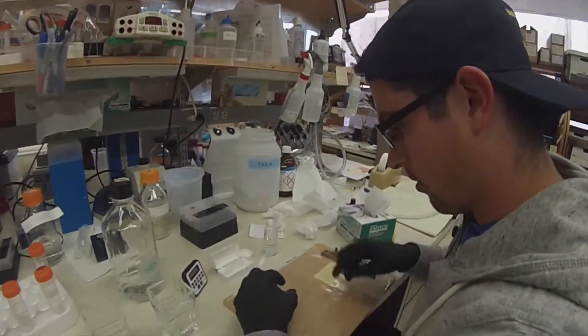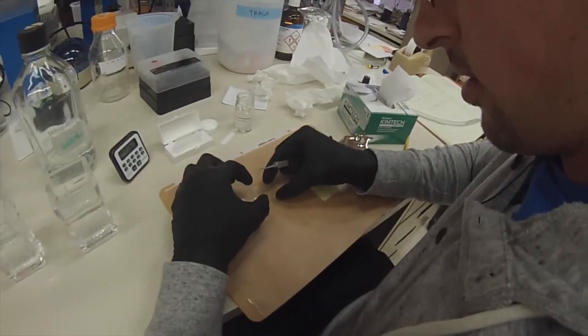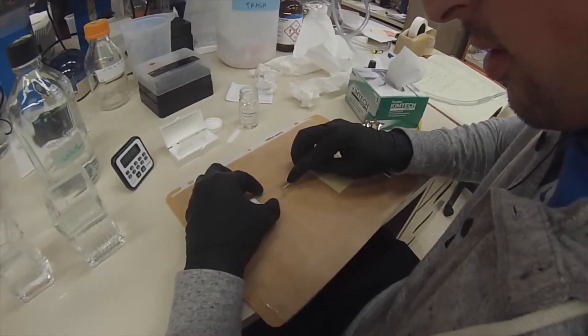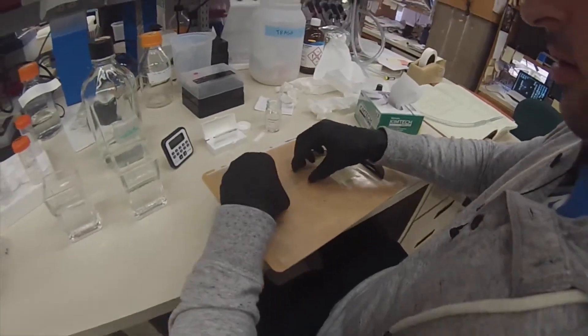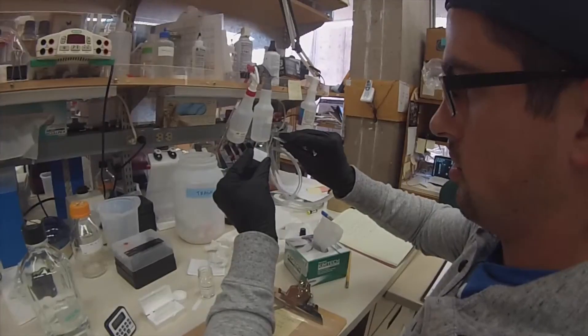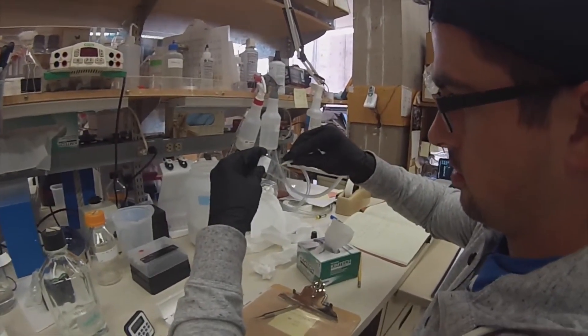Then you're going to take some forceps. With a lot of practice, you're now going to slowly bring from the right side and drag your forceps across so that the entire coverslip will lay flat on your samples. Make sure there are no air bubbles inside — slow and steady always wins that process.